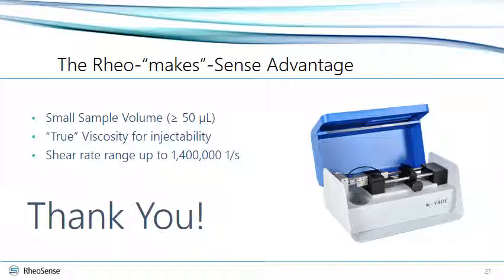Only certain viscometers and rheometer geometries have a fully characterized shear rate that allows us this true viscosity measurement, as opposed to apparent or index viscosity, which is helpful to order materials or fluids in terms of their viscosity values, but it doesn't give you this consistency between measurements.